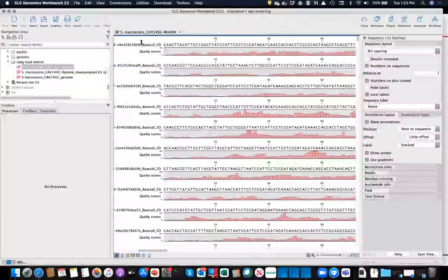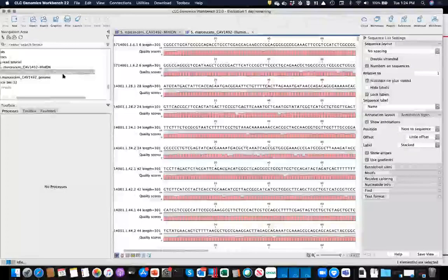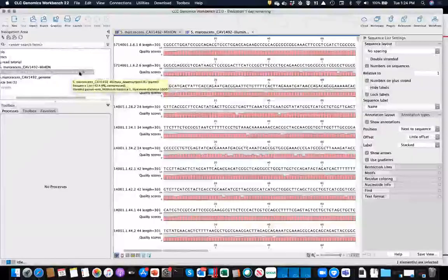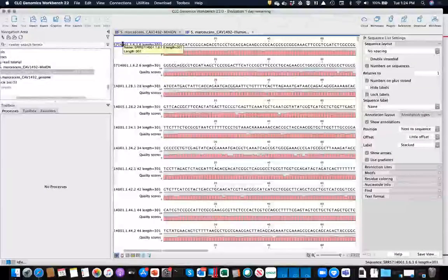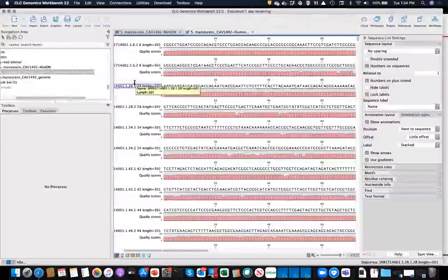And what you'll notice here is the read name, the A's, C's, T's and G's, and the quality score at that position for the base. Additionally, as I mentioned, the Illumina data gets merged into one file, and we can see that with the name of the file looks like R1. However, it has "paired" in parentheses in its name. And we can see when we look at the name of these reads that it's the R1 and then the R2 for the same mate. And so what it does, if you will, is zipper those files together. And so you have R1 and R2. If there's any failed reads, we would end up with an orphaned file that contains singletons.